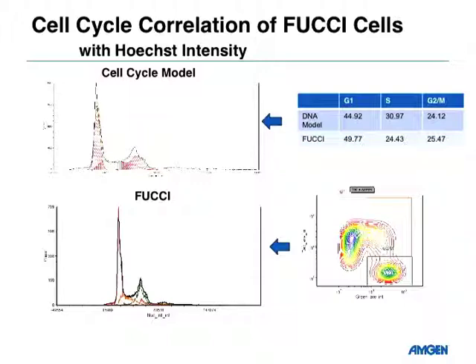And it has a very nice correlation between the Hoechst staining and a confirmation that the cells coming from the HeLa FUCCI model project very nicely onto the Hoechst integrated intensity.